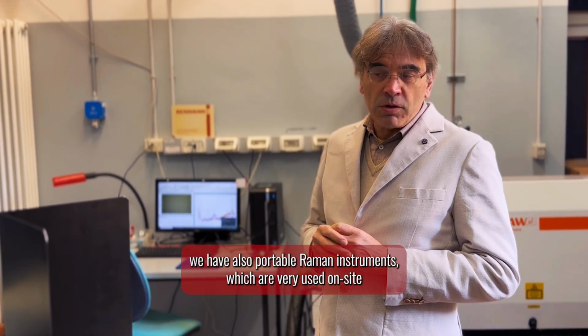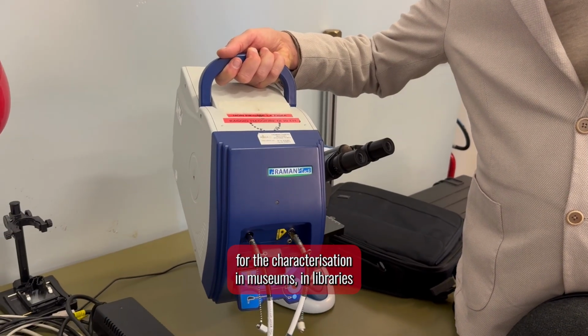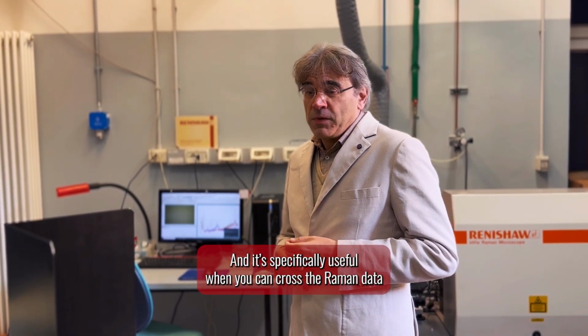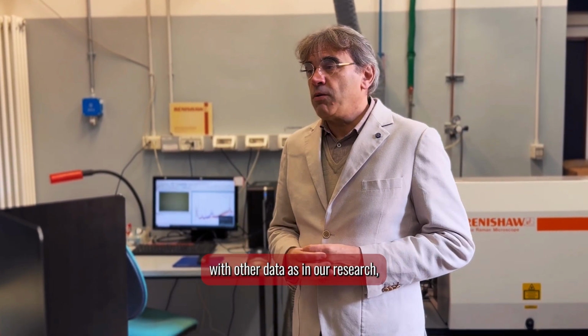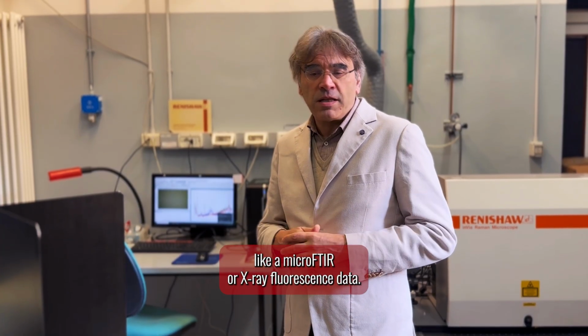For instance, we also have portable Raman instruments which are very much used on site for characterization in museums, in libraries, and also on archaeological sites. It is specifically useful when you can cross the Raman data with other data, as in our research, like micro-FTIR or X-ray fluorescence data.